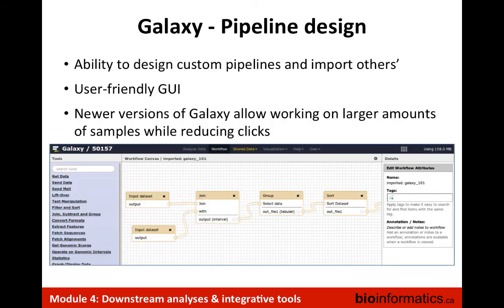And there's also this nice feature that you can design pipelines or workflows of steps where the first step will just be to select the data sets that interest you, and then all of the other steps will be done sequentially without having to provide anything, because you already said at this step use the output from the previous step with these specific parameters. So you get from inputting the data up to, at the end of your workflow, the output data. Again, there's a friendly GUI for that, where you can modify things by hand in your workflow if you want.